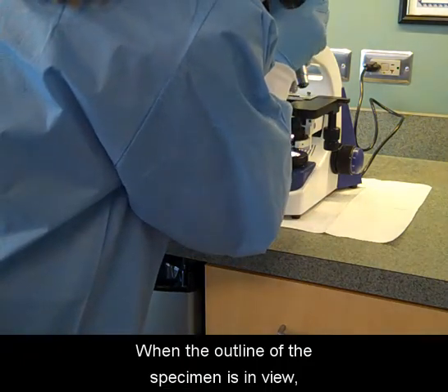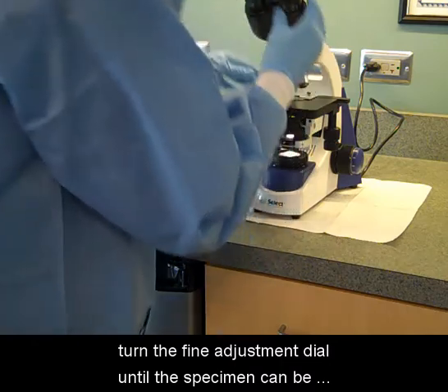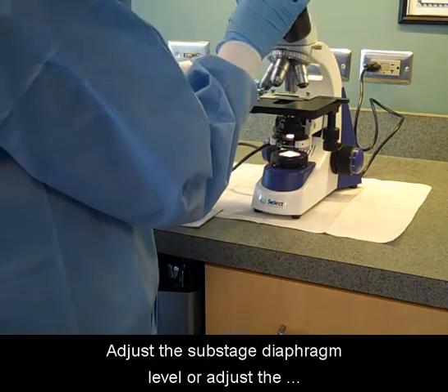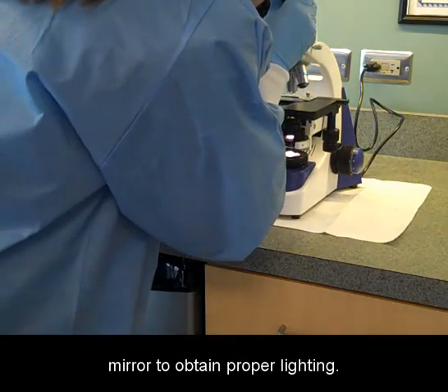When the outline of the specimen is in view, turn the fine adjustment dial until the specimen can be seen in detail. Adjust the sub-stage diaphragm level or adjust the mirror to obtain proper lighting.